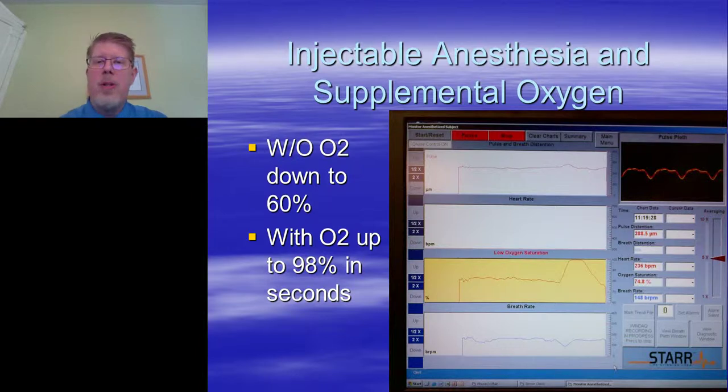And I wanted to put this in here, but let's not forget, anesthesia is an art too. This was a summer project for one of my technicians, Teresa, who did fantastic work. What she did is she simply went in mice and rats to see if we were seeing similar things that we had seen in large animals. So anesthesia, injectable anesthetics, a lot, especially with rodents.